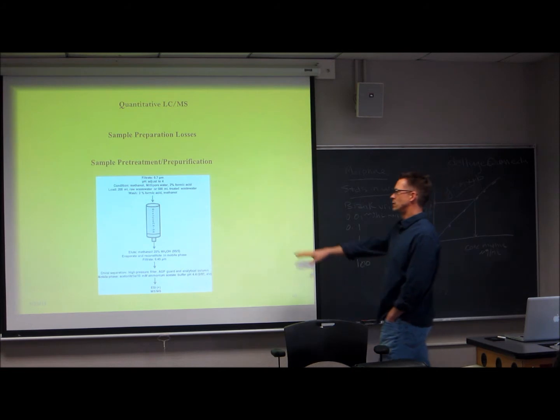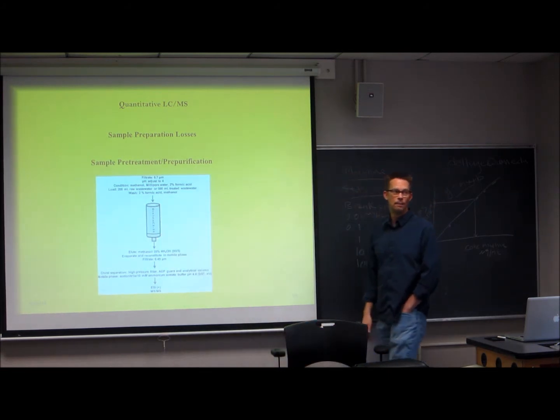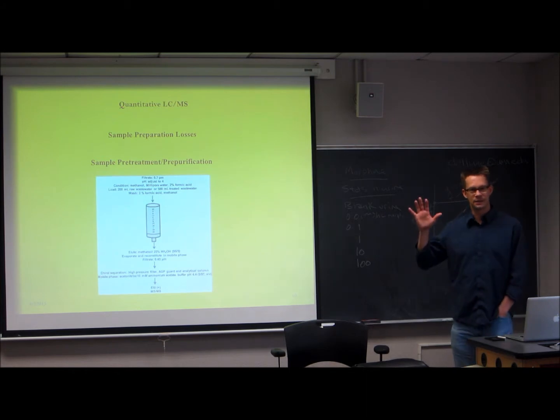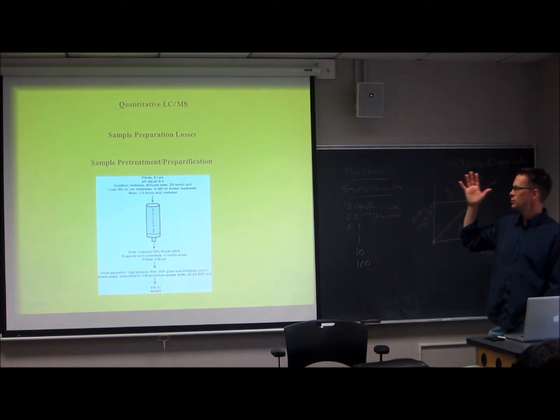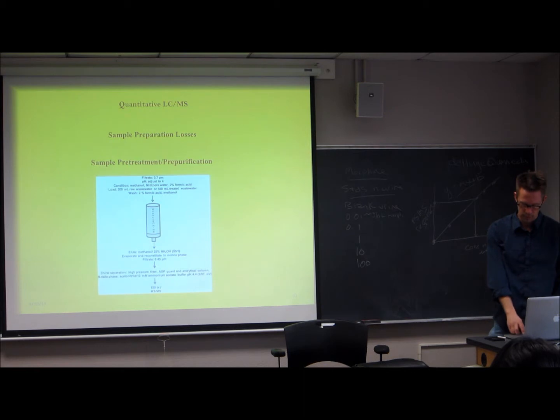So if you don't get 100% yield here, which you never do, and you haven't added some internal standard to compensate for losses and for lack of yield on your sample pretreatment device, all bets are off for accurate quantitation.